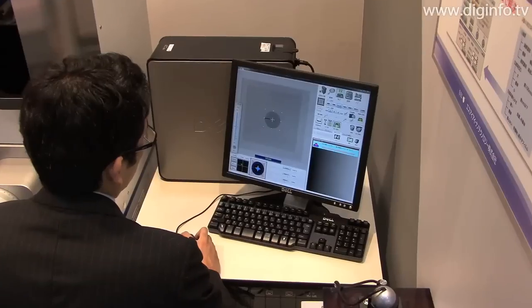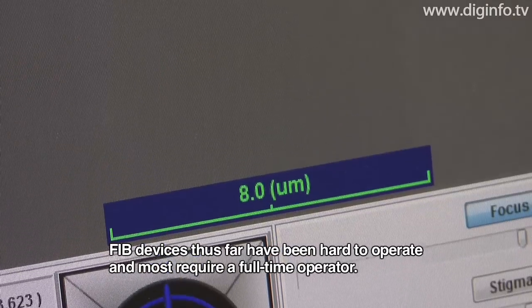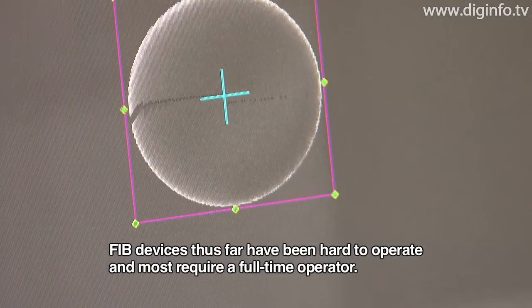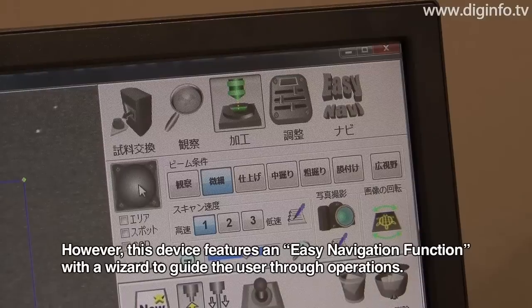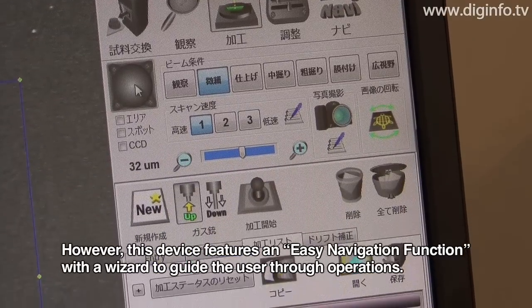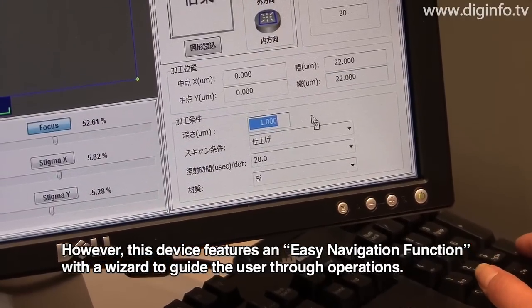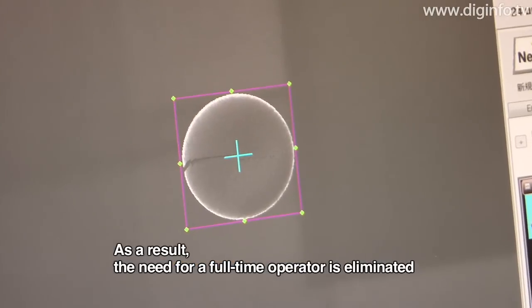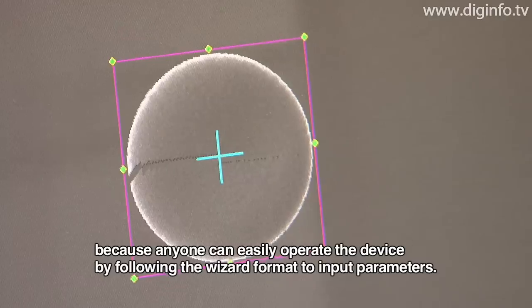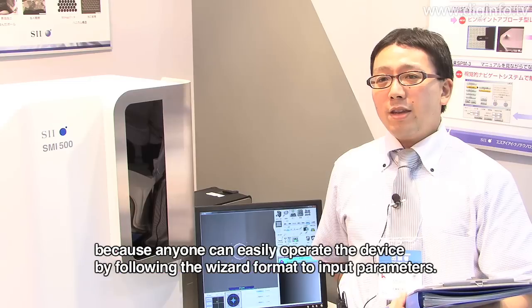One of the main features of the FIB device is that the software has been organized to make it an easy operation device. The wizard system is used to provide parameters, so there is no need for a special operator to use it.